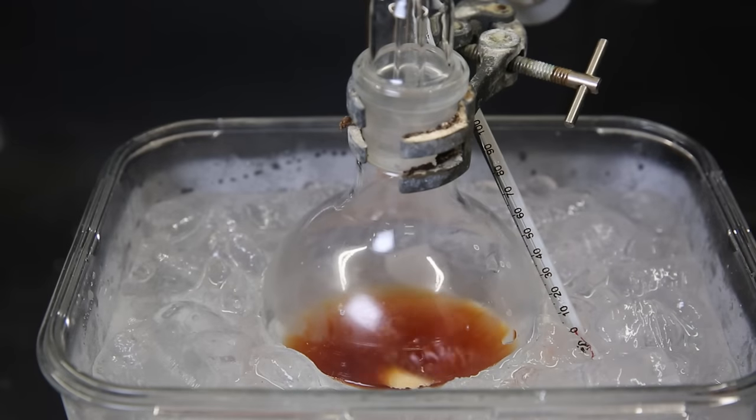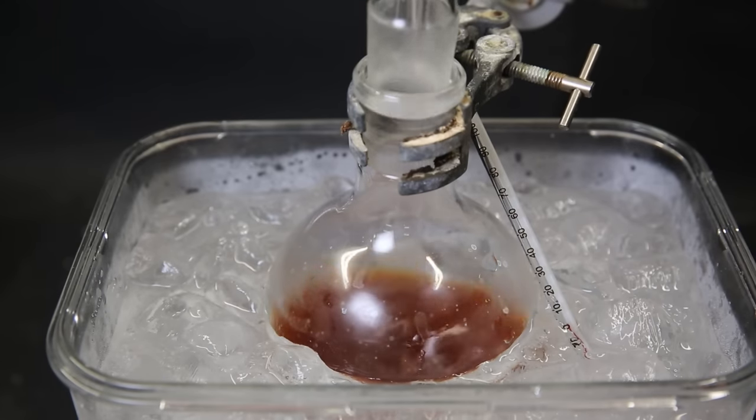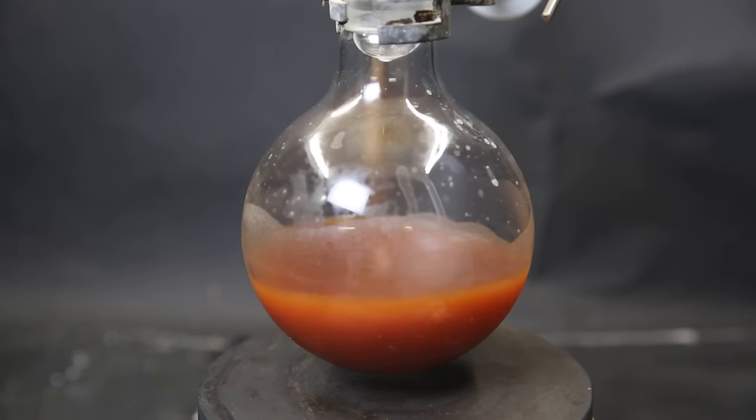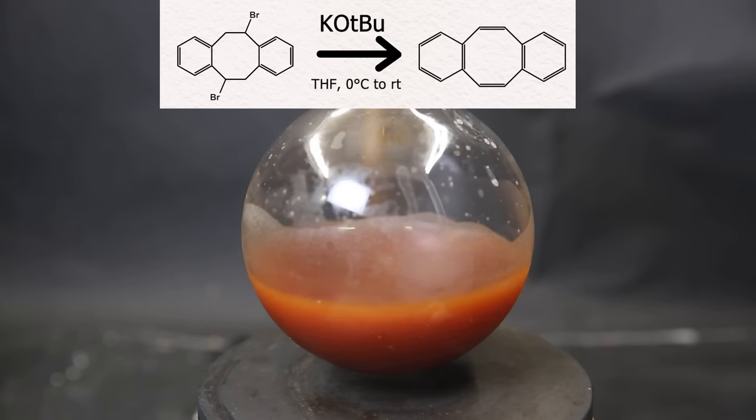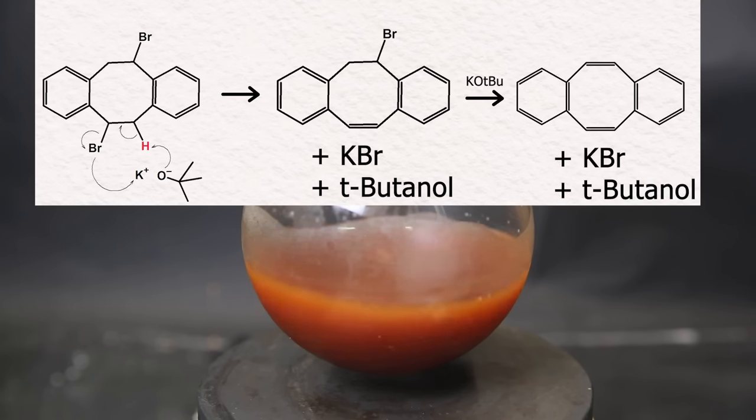The reaction mixture quickly changes color and gradually becomes darker. When the addition is complete, I remove the dropping funnel and the ice-salt-water bath. I then leave it to stir for 3 hours at room temperature to allow the reaction to complete. During this reaction, the KOtBu will react with the brominated product to form the final product containing the double bonds. To explain this reaction requires a bit more detail. Since KOtBu is an extremely strong base, it can take up a hydrogen easily. The tert-butoxide will steal a hydrogen from the carbon adjacent to the carbon the bromine is attached to and become tert-butanol.